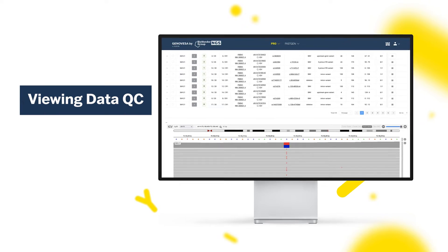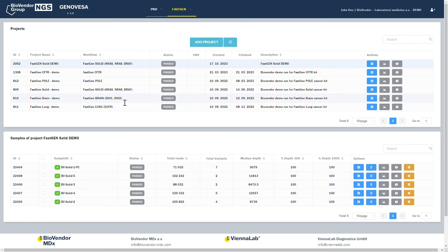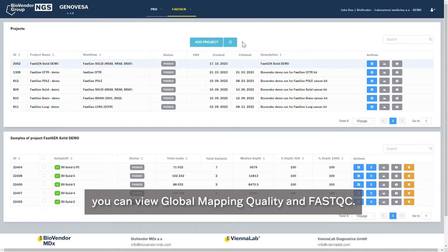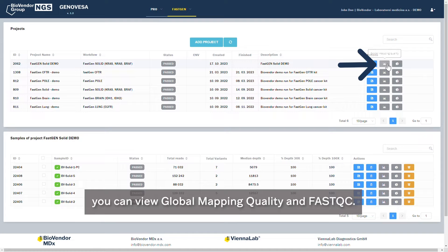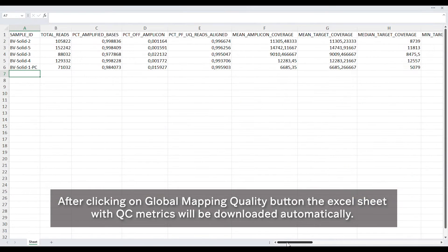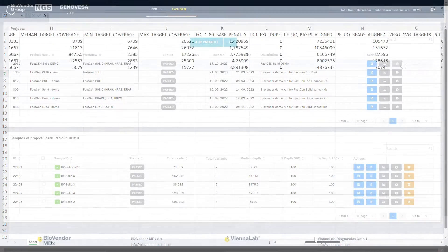Viewing Data QC. Once your analysis is complete, you can access several quality control metrics. For the entire project, you can view global mapping quality in FastQC. After clicking on the Global Mapping Quality button, the Excel sheet with QC metrics will be downloaded automatically.